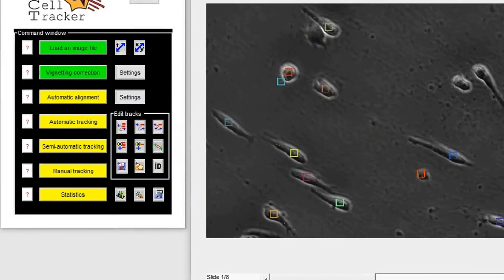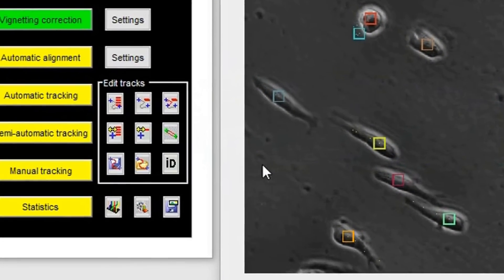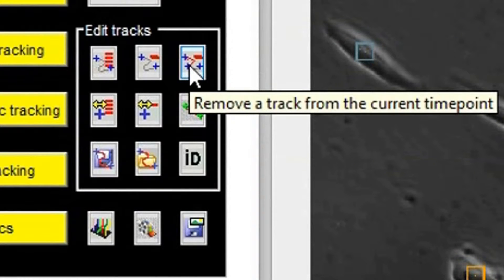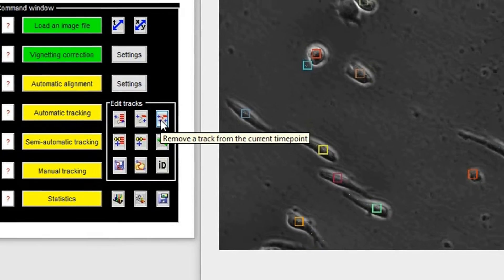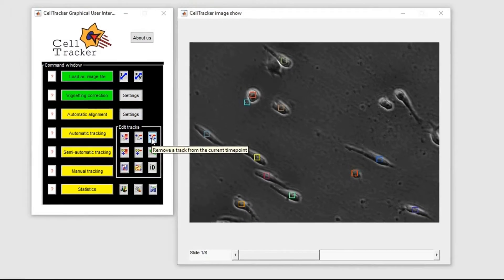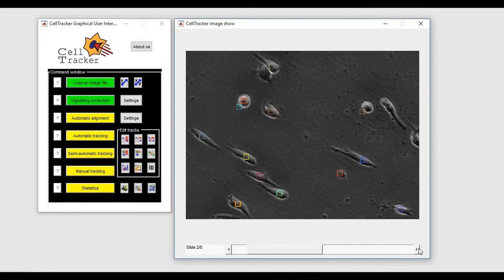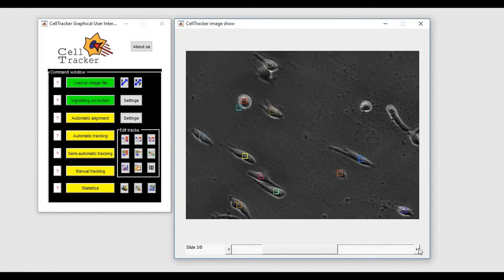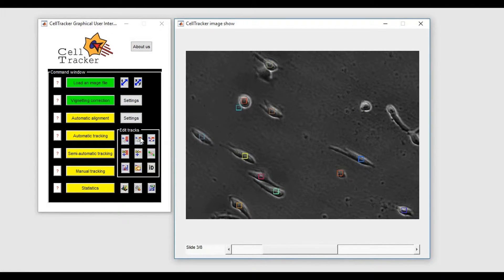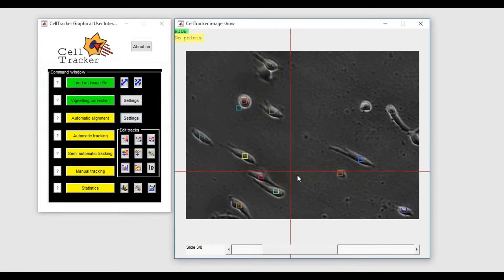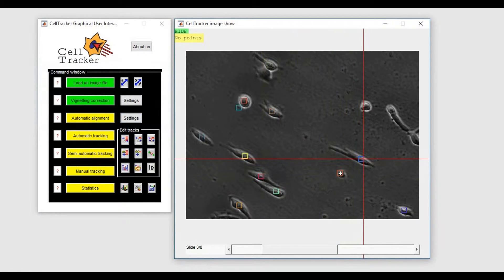Or, you can remove a part of a track with the Remove a Track from the Current Time Point button. In this case, you have to move the slider to the desired time point and then you have to select the tracks you want to delete.